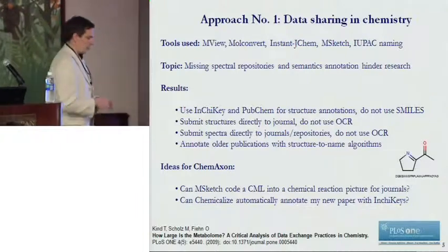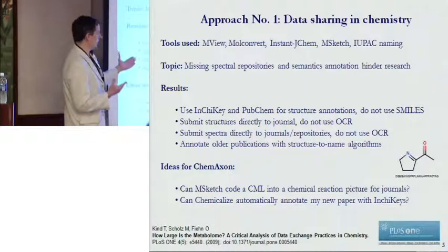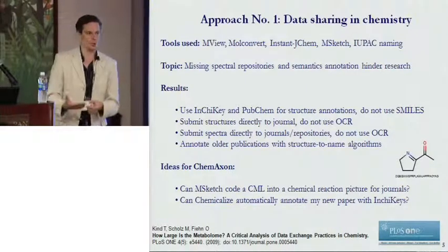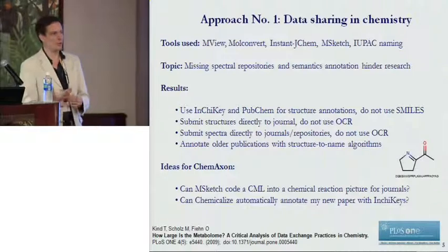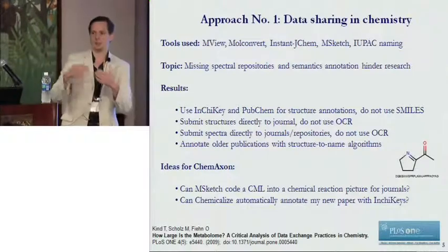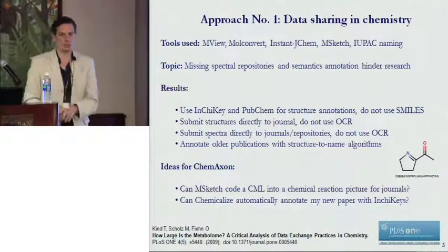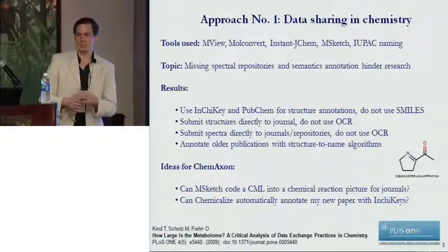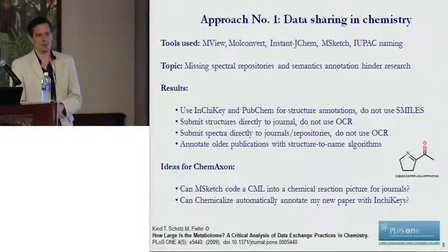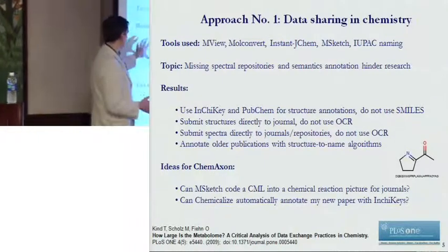So the good way would basically be, if you publish a structure or reaction, why would you put it in a picture on a paper? You want to have it in a reaction database. So why not directly submit the reaction into a reaction database and keep it there? And the same for high resolution spectra. It doesn't make sense to do optical character recognition on a high resolution NMR or mass spectrum. That doesn't work. And that is what we investigated.